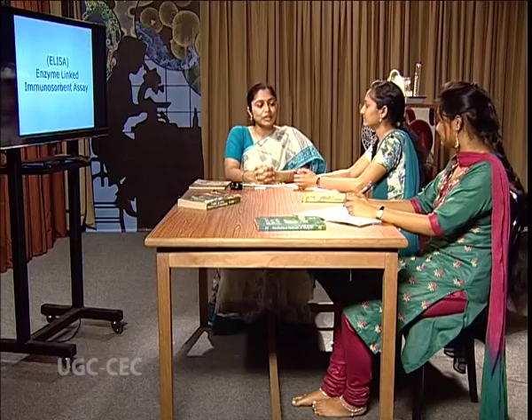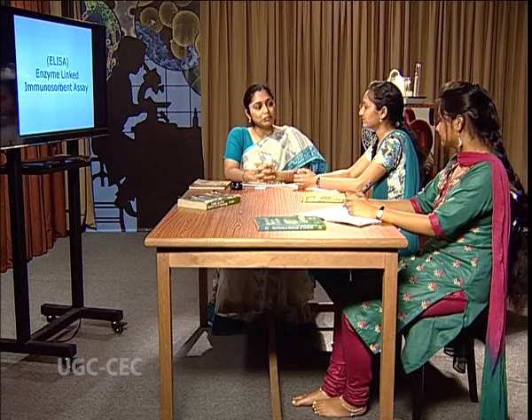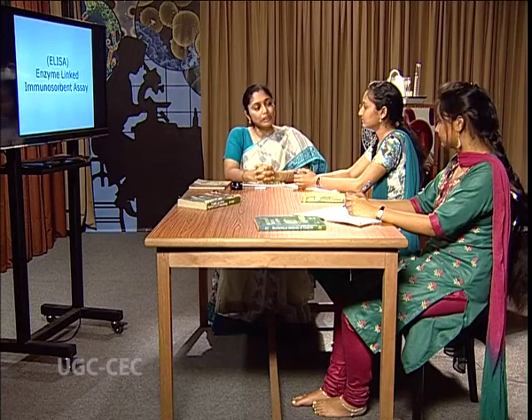Dear students, today I will discuss enzyme-linked immunosorbent assay, or ELISA. It is an immunoassay which is routinely done in healthcare, in scientific research, and also in environmental and agricultural applications. And this immunoassay involves the use of an immunosorbent.